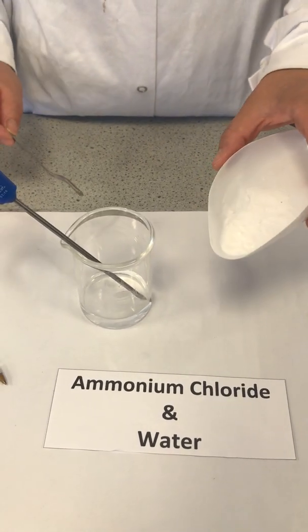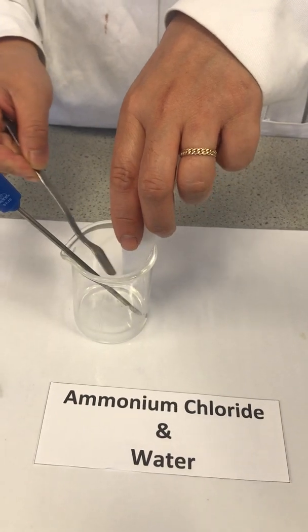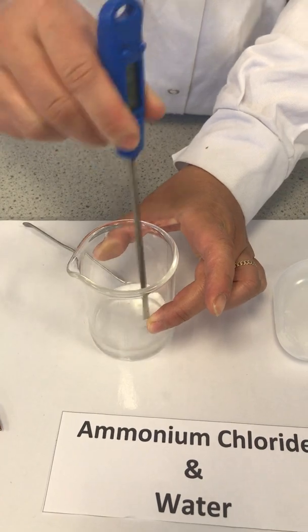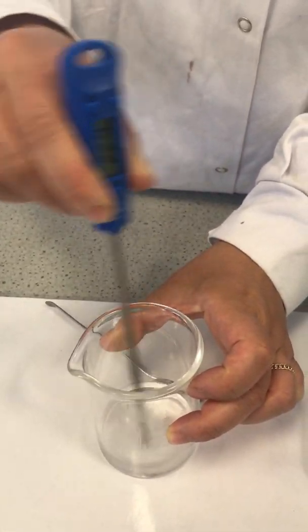Then we add ammonium chloride and stir nicely. Record the temperature after stirring.